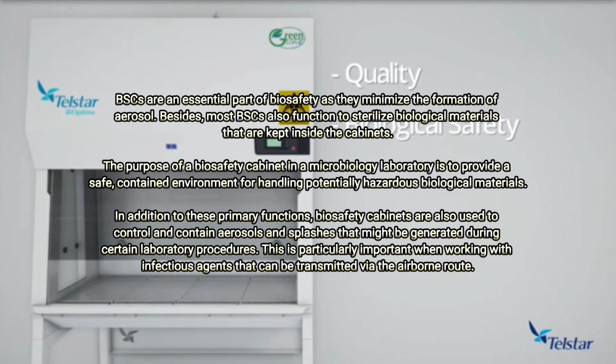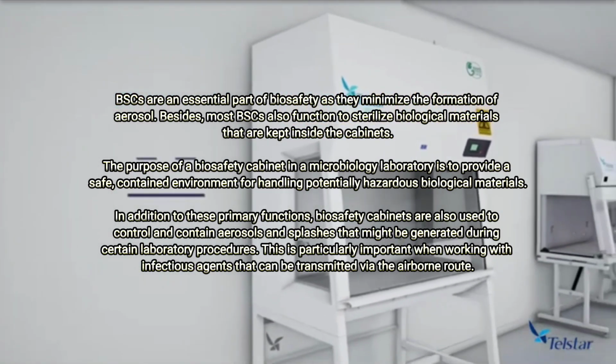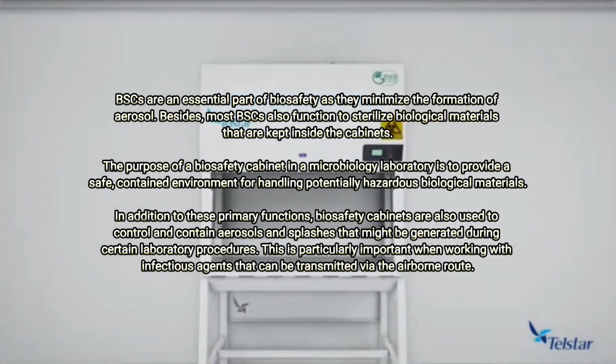The purpose of a biosafety cabinet in a microbiology laboratory is to provide a safe, contained environment for handling potentially hazardous biological materials. In addition to these primary functions, biosafety cabinets are also used to control and contain aerosols and splashes that might be generated during certain laboratory procedures. This is particularly important when working with infectious agents that can be transmitted via the airborne route.